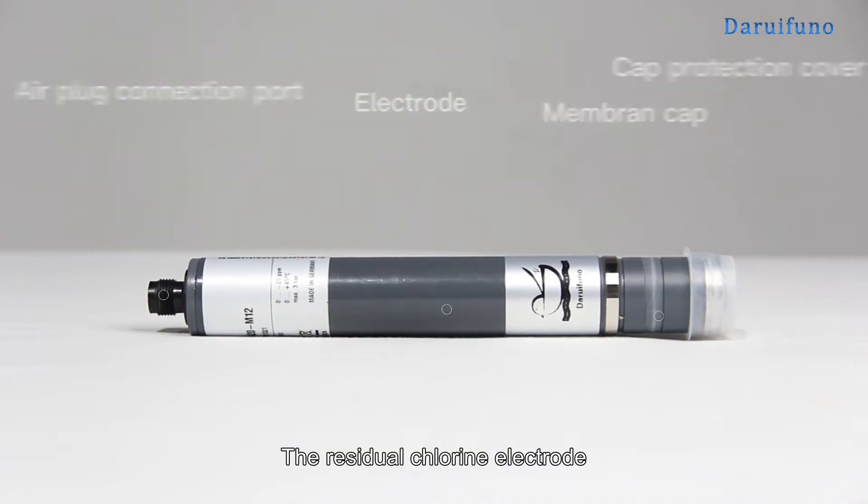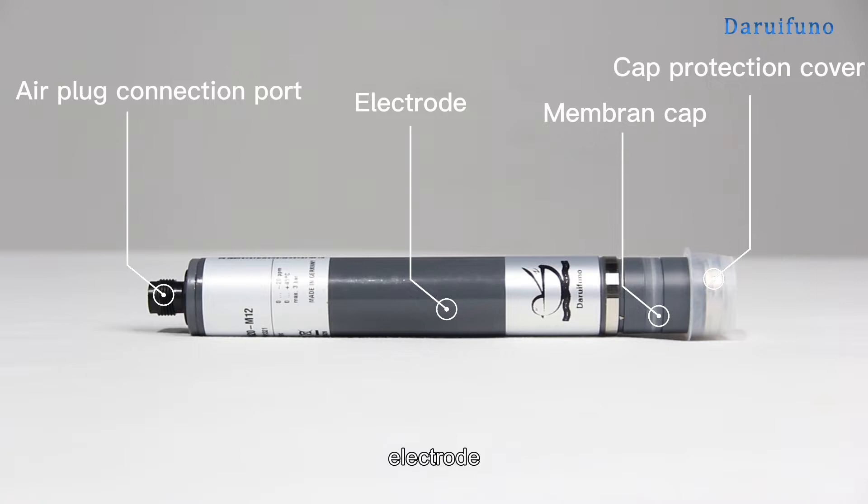The residual chlorine electrode is composed of an airflow connection port, an electrode, a membrane cap, and a cap protection cover.